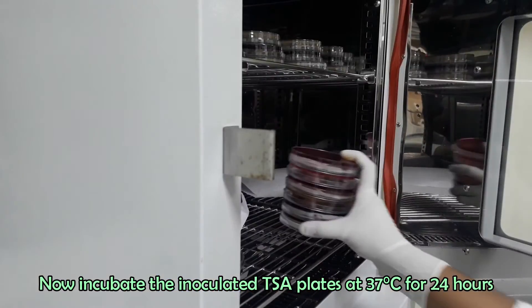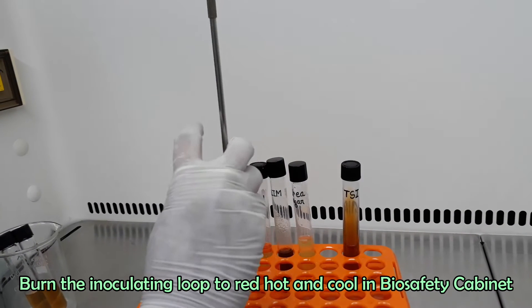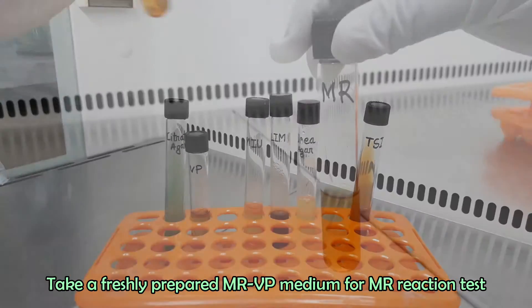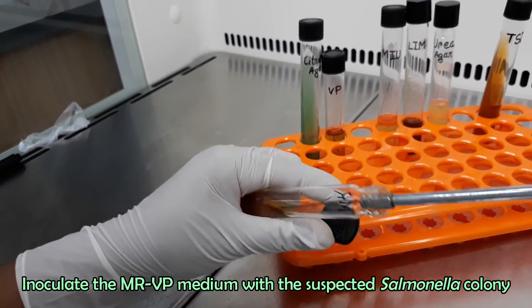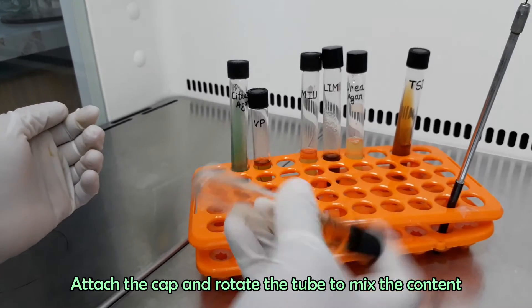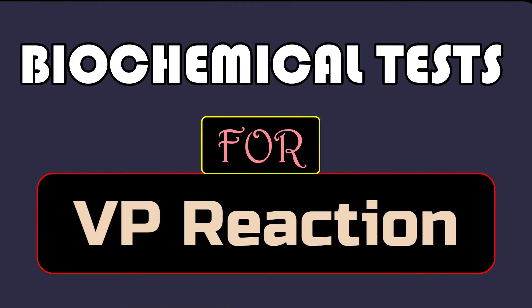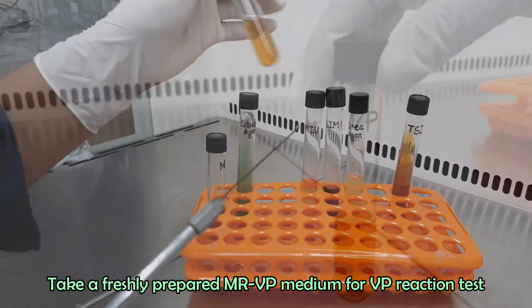Take out the plates after incubation. We got pure culture of suspected Salmonella species, and now we need to confirm it by different biochemical tests. Our first biochemical test is for methyl red reaction. Burn and cool the inoculating loop, pick a single colony from the pure culture, and inoculate MRVP medium for the methyl red test. Similarly, inoculate another MRVP medium with the bacteria for the VP test.